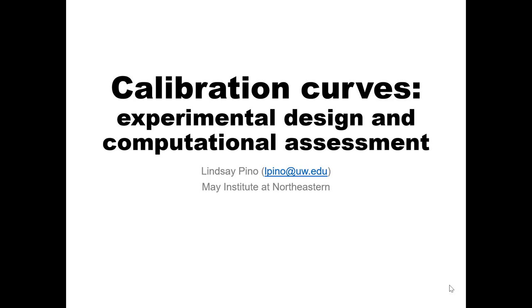It's great. We're going to talk about the last set of validations, and we allotted the most time for this because I think it's maybe the most important, and maybe the least intuitive out of all of them. Calibration curve. I'm going to talk a little bit about the experimental design of a calibration curve, and then a little bit about some of the various computational assessments.